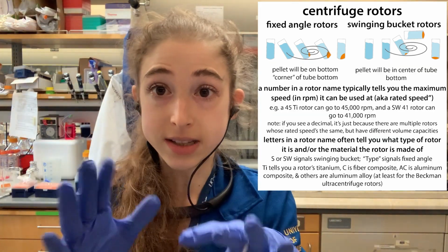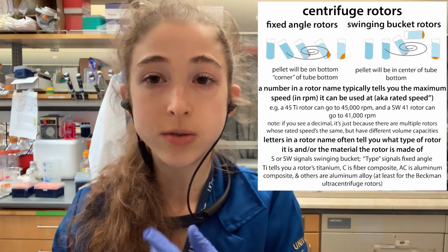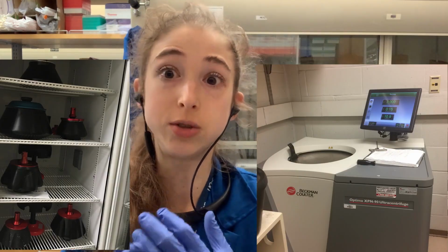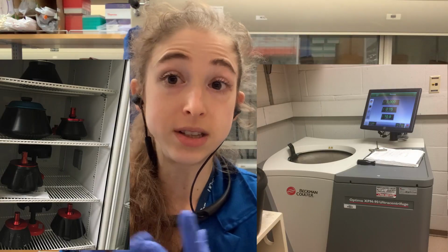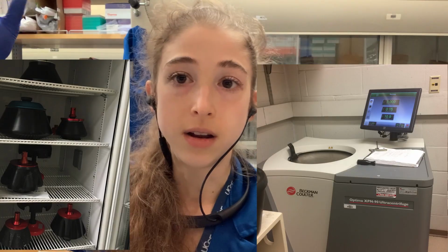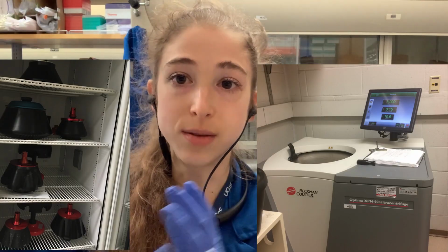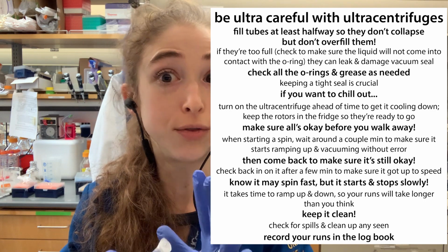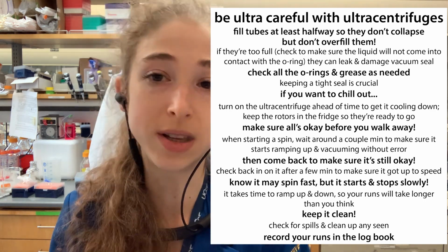That is one of the differences. And then we have the difference of speed. We can talk about normal centrifuges, which can go up to a certain speed, and then we have ultracentrifuges, which go super duper fast. With these ultracentrifuges, we're getting up to 40,000 RPM, 70,000 RPM, 100,000 RPM, really crazy amounts. There's going to be a lot of force on these little tubes, so for those, you want to make sure that you're using special tubes and things like that.